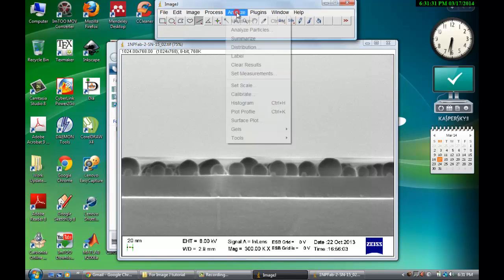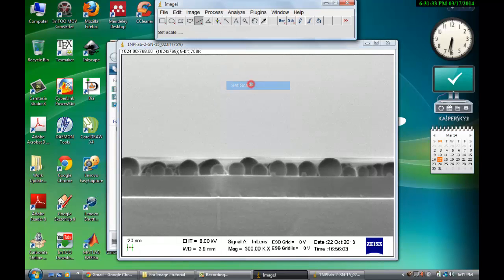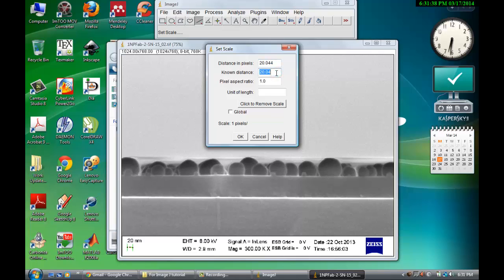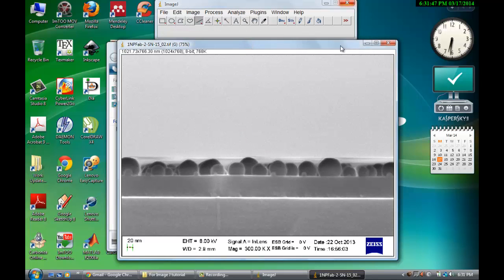Now go to Analyze, Set Scale. Here it shows that the distance in this picture is this much and the equivalent distance as mentioned is 20. Units of the length is nanometer. Let's make it global. Okay.